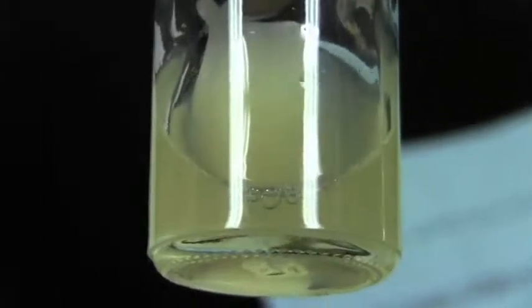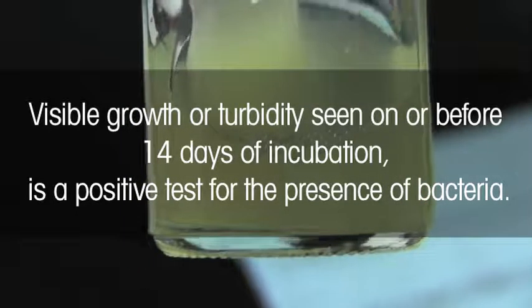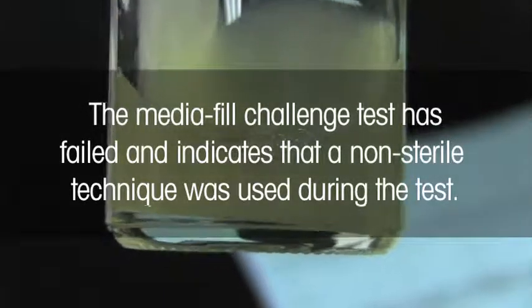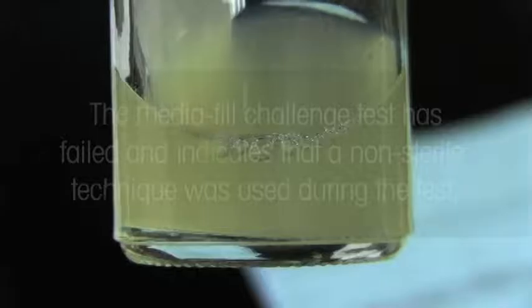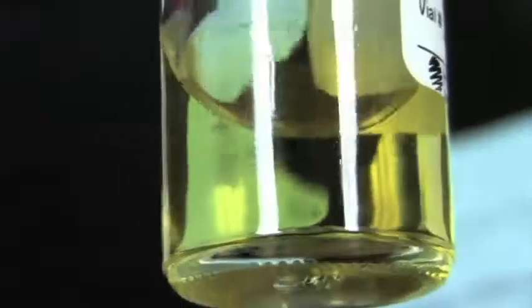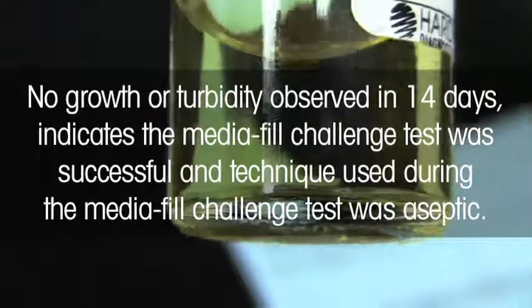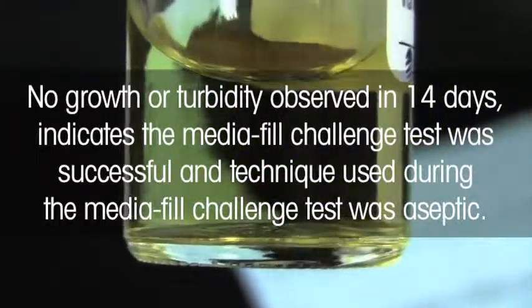Visible growth or turbidity seen on or before 14 days of incubation is a positive test for the presence of bacteria. The MediaFill Challenge test has failed and indicates that a non-sterile technique was used during the test. No growth or turbidity observed in 14 days indicates the MediaFill Challenge test was successful and the technique used was aseptic.